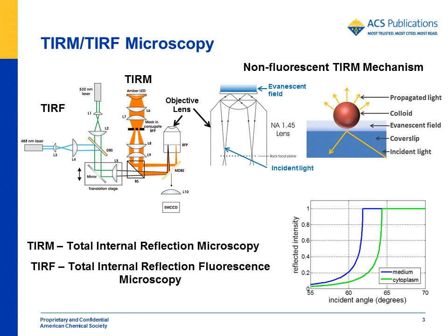The mechanism of image formation in total internal reflection microscopy can be considered to be akin to frustrated total internal reflection. For a uniform object with relative low refractive index, total internal reflection will occur and the image will appear bright and homogeneous since all the light is evenly reflected. When an object moves into the evanescent field, which either scatters or refracts light into propagating light, energy is removed from the incident beam, resulting in a reduced intensity of the internally reflected light.